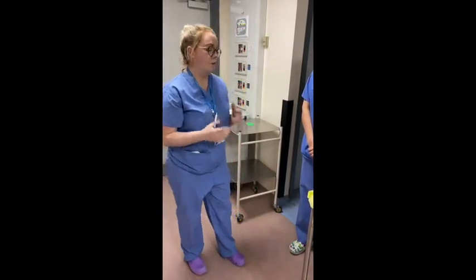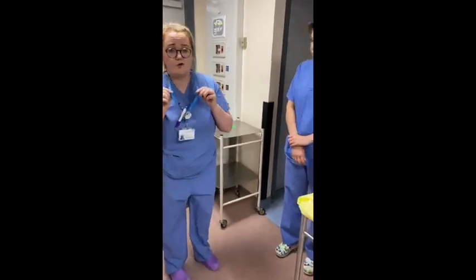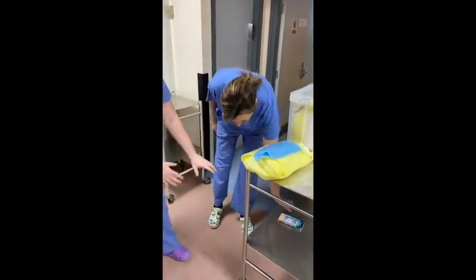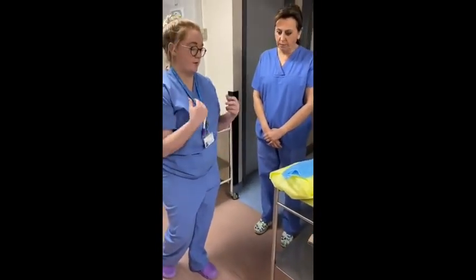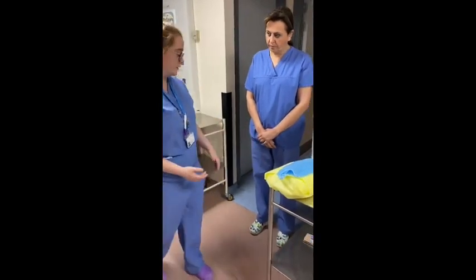Then once we're ready, we have all of our equipment that we need to bring with us when we're about to enter the lab. You need to remove all your personal equipment, i.e. lanyards, phones, wallets, whatever. We are going to have some form of a locked box here that once everyone's equipment that they don't need to bring in is in there, we can seal it so nothing hopefully will get stolen.